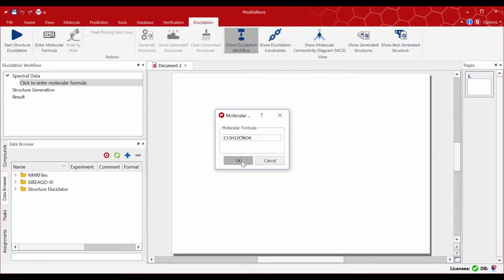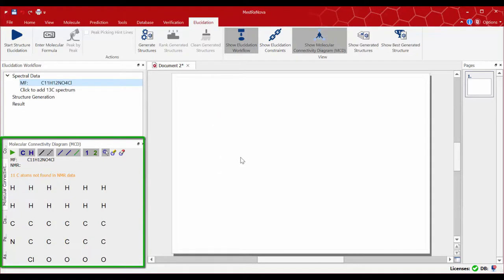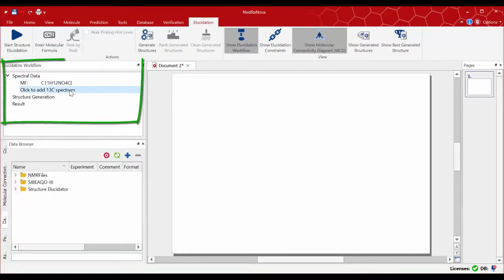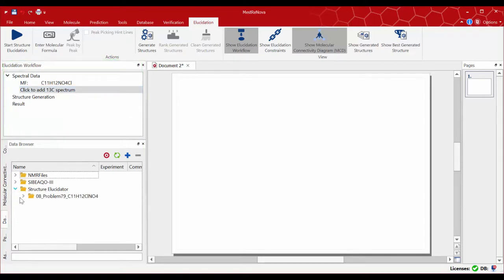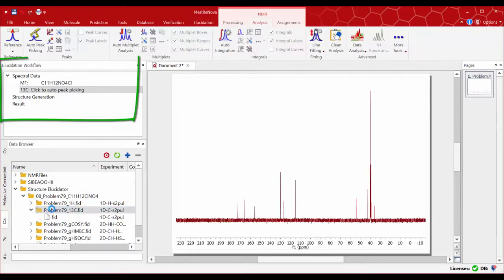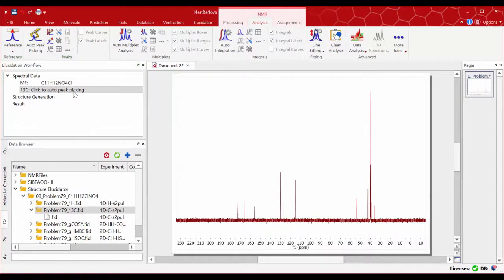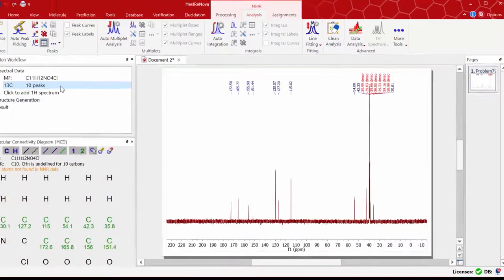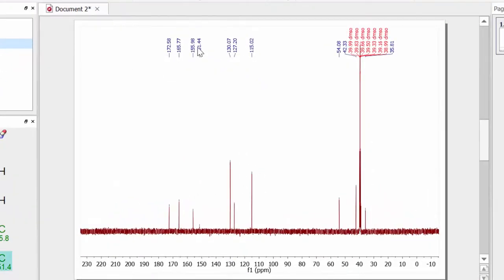You can now follow the spectral data workflow and click 'Add your carbon spectrum.' Then from the data browser, just drag and drop your data file. On the workflow, click 'Auto Peak Picking.' You can use the delete peak option on any peaks you may consider not useful for the elucidation, such as ones with very low intensities.